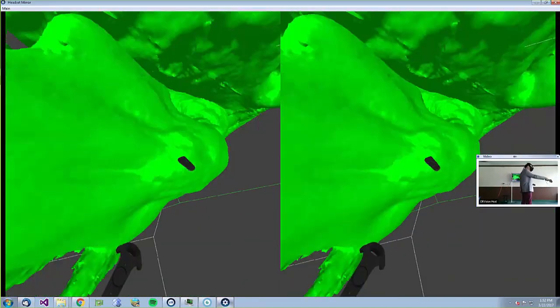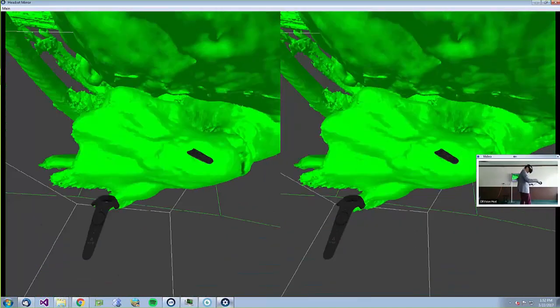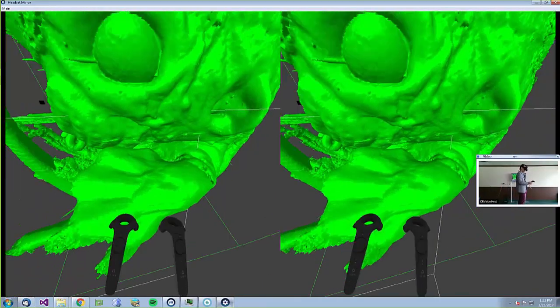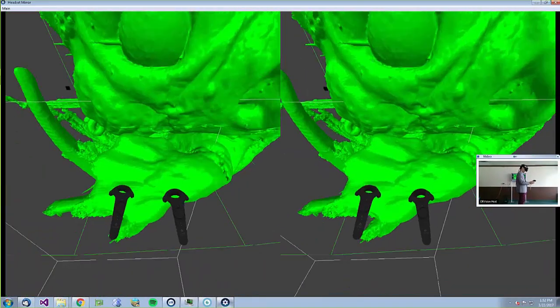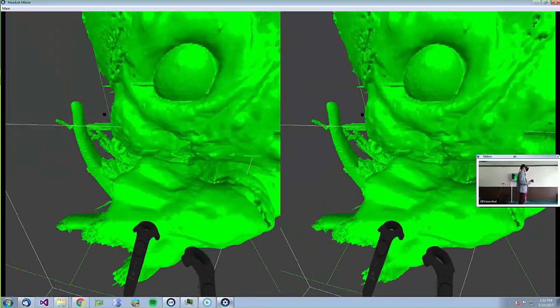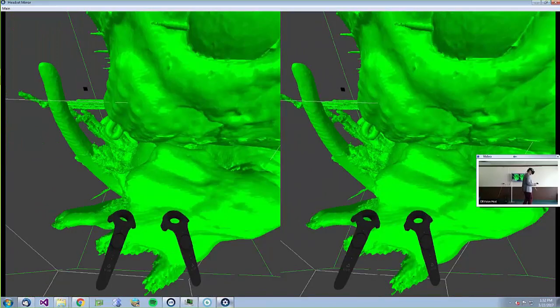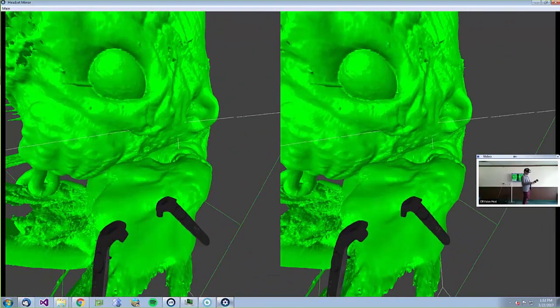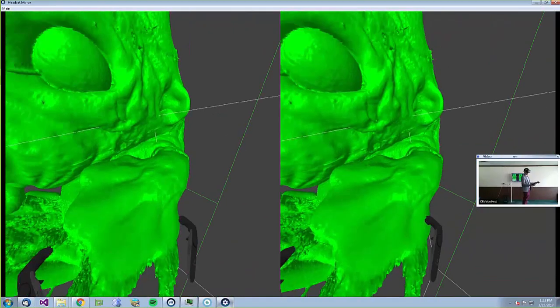Of course, if we prepare the display differently, we can actually look at different grayscales rendered differently. So we could look at, for example, the bones or some parts of the digestive system appear on their own. Of course, if it's fluorescently labeled with different markers, then we could have that also displayed here.